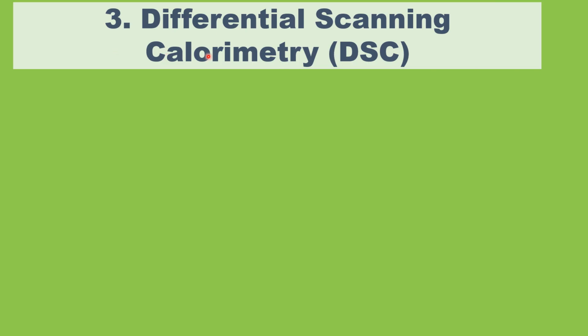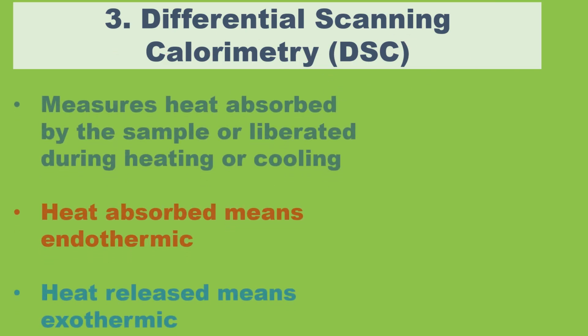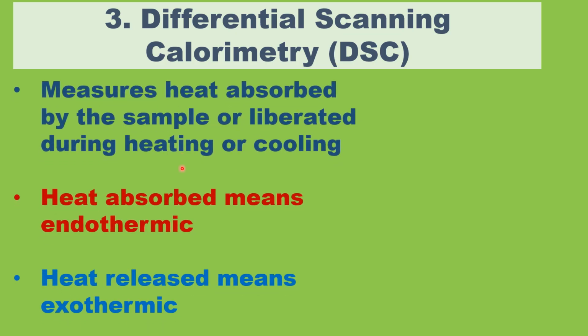The third technique is differential scanning calorimetry, DSC. In DSC, it measures heat absorbed by the sample or liberated during heating or cooling.